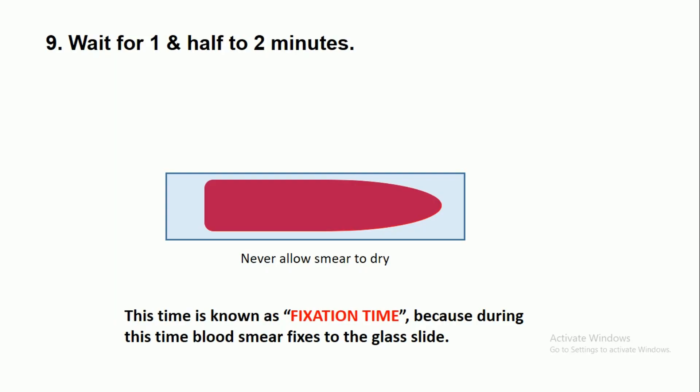Wait for one and a half to two minutes. During this time, never allow the smear to dry. This period is known as the fixation time, because during this time the blood smear fixes to the glass slide.